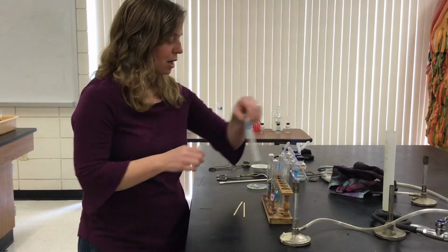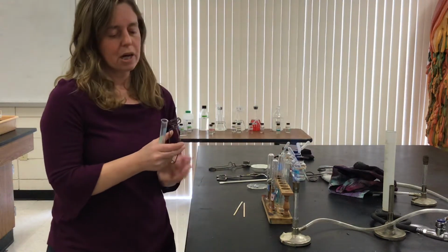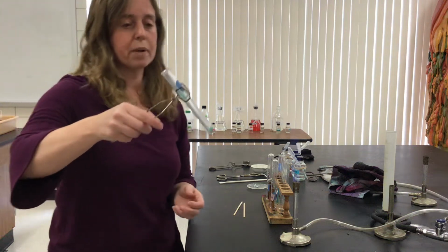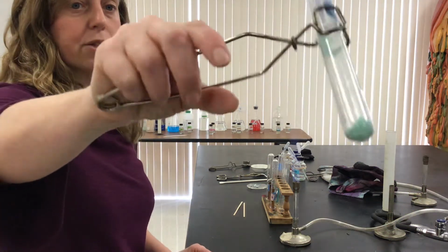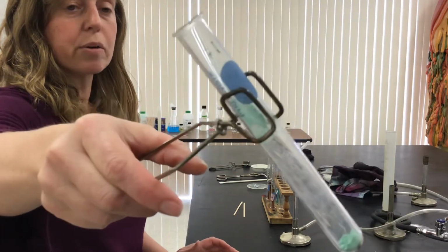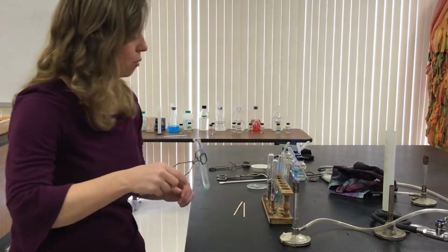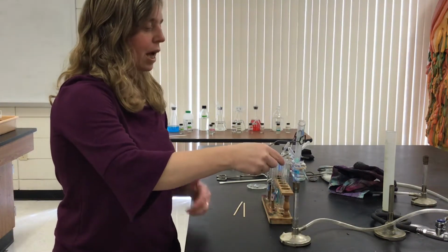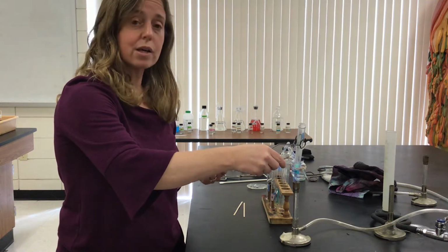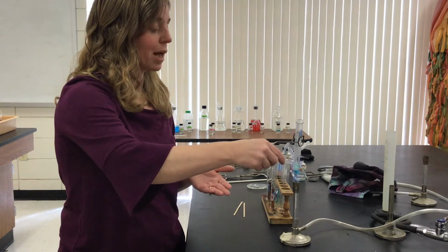Next, we're gonna do what we call a decomposition reaction. So I've gotten some powder. This is a copper carbonate. So it's a green copper colored powder, and we're going to decompose it into carbon dioxide gas and copper oxide. Okay. So I'm going to heat it in the flame, and you notice how I said we're going to produce carbon dioxide and copper oxide. Now we'll be able to see the copper oxide because it's going to turn black in color.